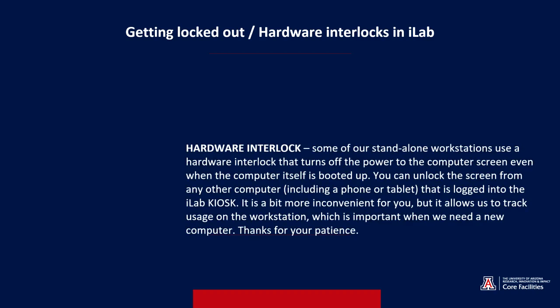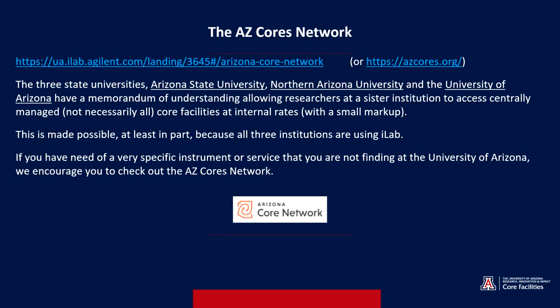On one or two of our mostly image analysis workstations, they use a hardware interlock that turns off the power to the computer screen, even if the computer itself is booted up. You can unlock the screen from any other computer, including your phone or a tablet, as long as you're going through the iLab kiosk. It allows us to track usage, and that can be important when we need a new computer to replace what we already have or to get service on it.